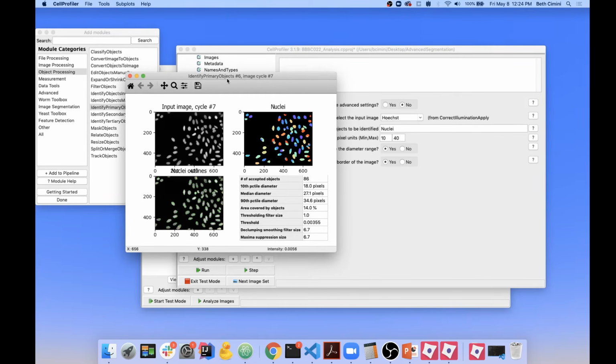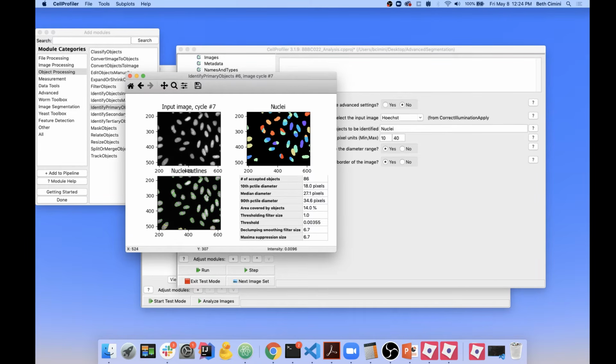Okay, this is CellProfiler's first pass at doing a segmentation. So now not only are we determining which pixels are positive and which pixels are negative, CellProfiler is trying to break them down. We can't see yet how it's trying to do that, we just know that it is. If I zoom in, I can see that my threshold still looks pretty good here. It looks like it's doing a good job of the first step, which is figuring out what is stuff or non-stuff. What it's not doing a good job of is breaking stuff down into objects. Now, the only tunable thing I have at this stage is what size it thinks my objects should be.